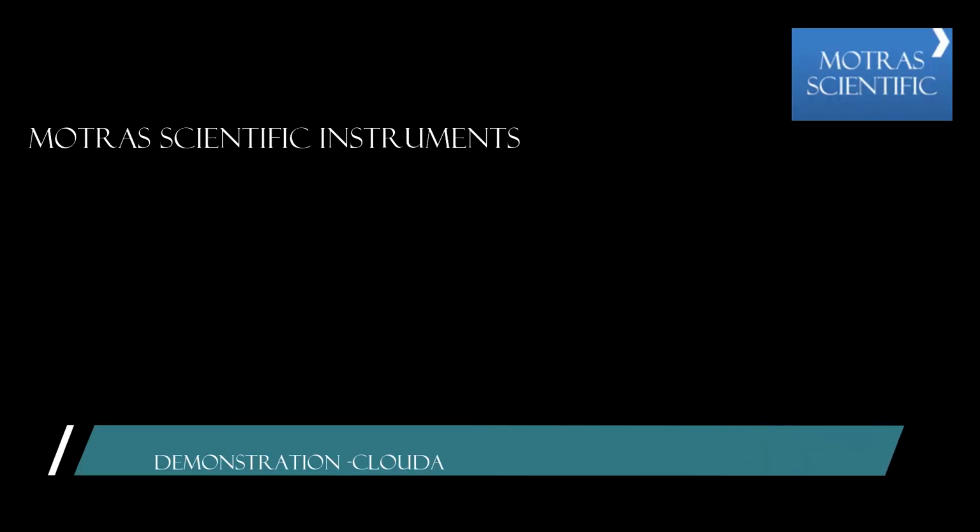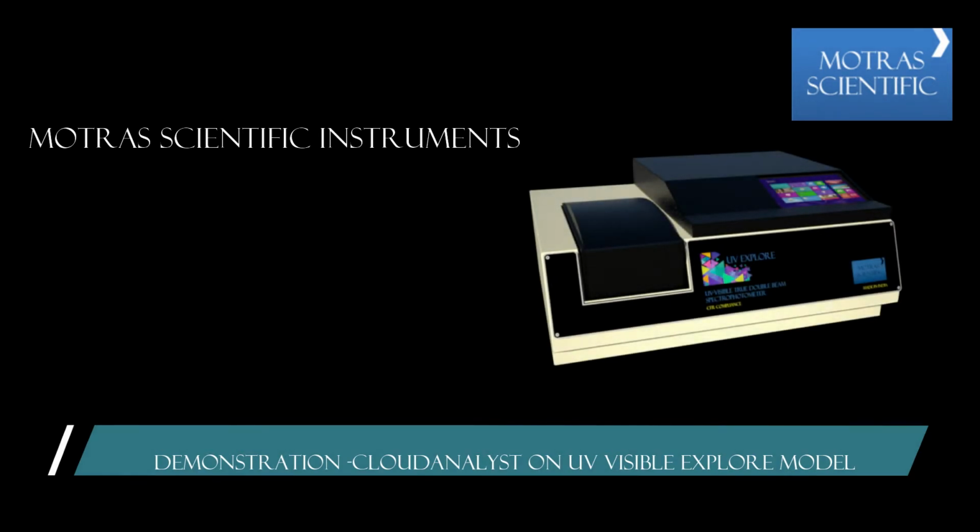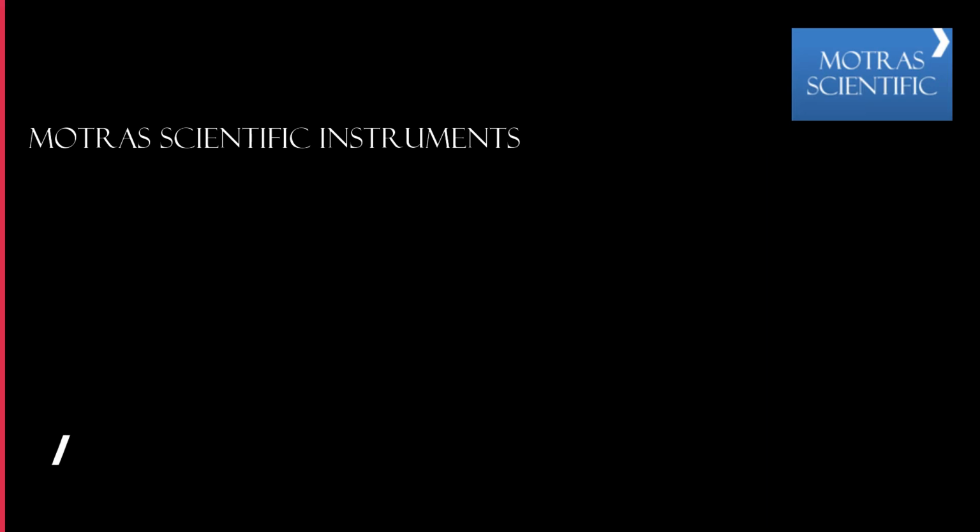In this video, we will look at our cloud-based test store, CloudAnalyst. Using this feature, users can download custom tests for spectroscopy and execute them on our instruments. We will be using a UV visible double beam spectrophotometer, UV Explore model, and install the nitrate test from the CloudAnalyst.